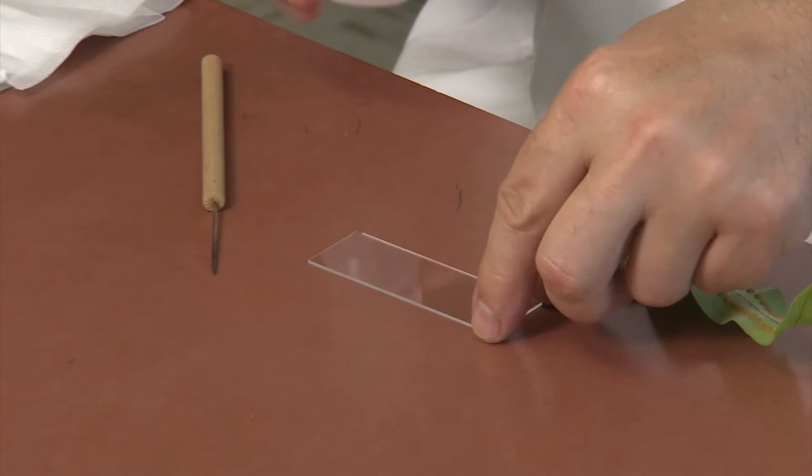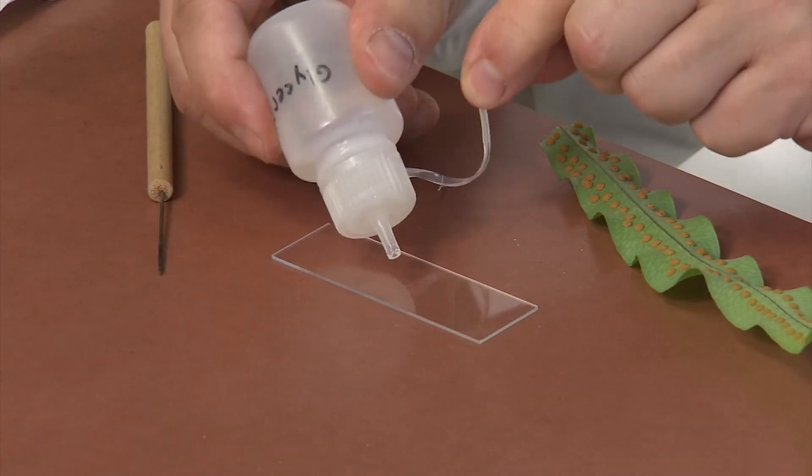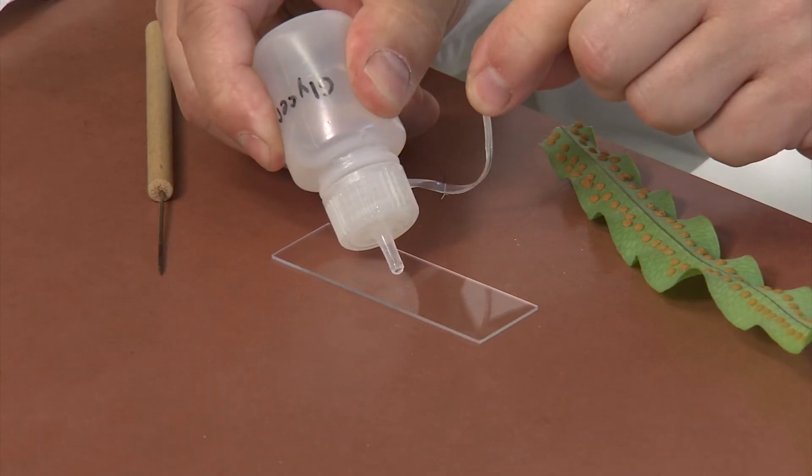Place a clean microscope slide on a flat surface. Add a drop or two of glycerin to the center of your slide.